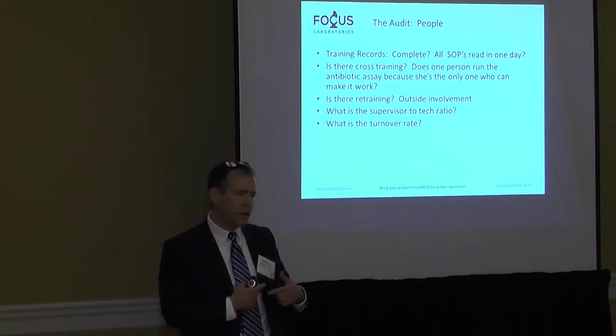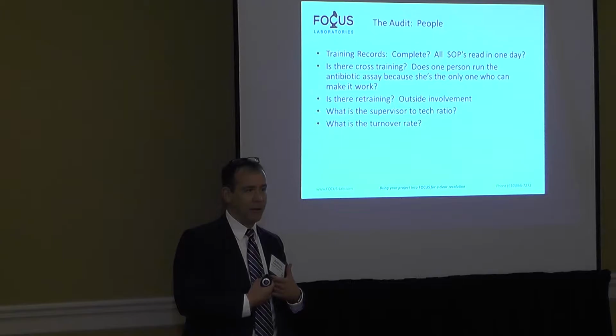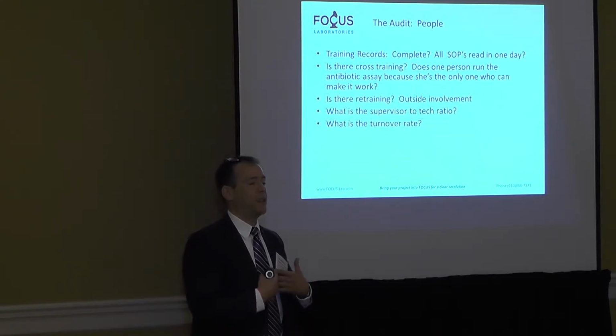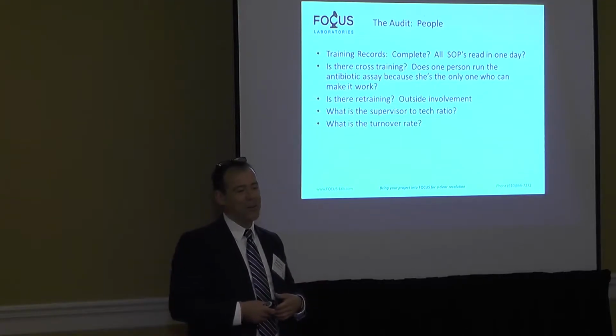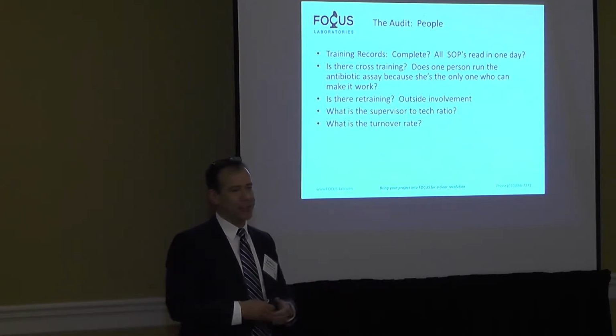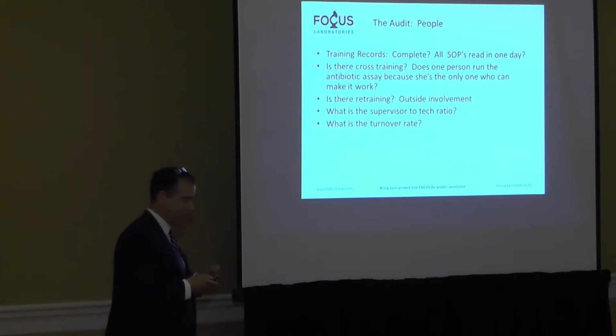I think it takes about a year for somebody to really get it, because GMP is not training, right? It's a way of life. They have to do it. I don't care how many times I tell them, don't write on the plate. It's when you glue the plate to their lab notebook because it's original data that it starts to sink in. It takes a long time to get that way of thinking. So look at that for laboratories, that's important.